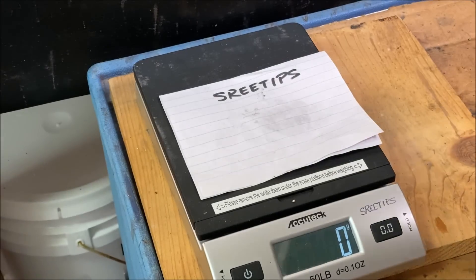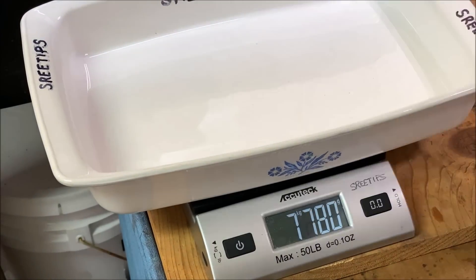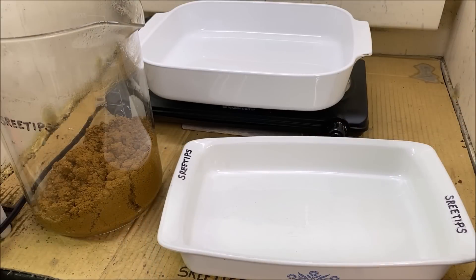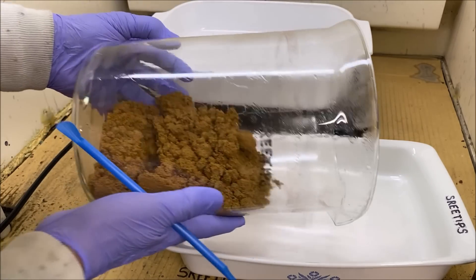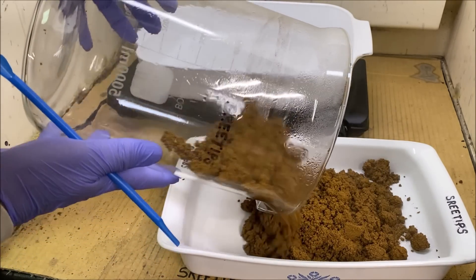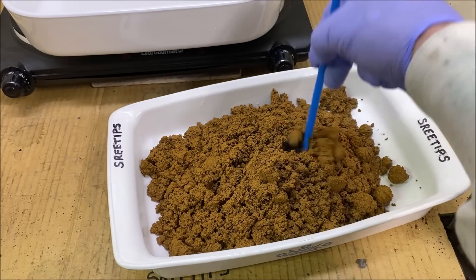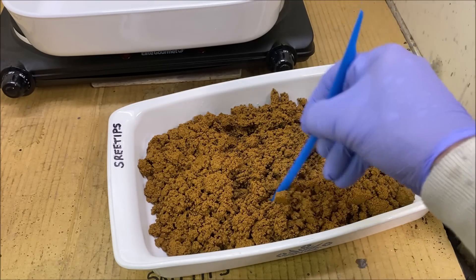I picked these up at local sales. Let's get a weight on the empty pan — one thousand six hundred and four grams. Now we're going to carefully transfer the gold into this drying dish and flatten it out a little to increase the surface area so we get it dried out and move to the next step.